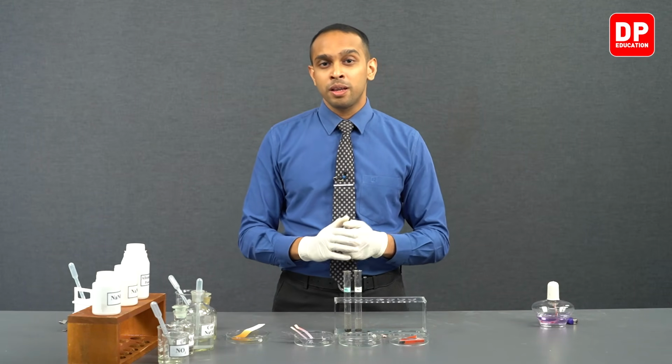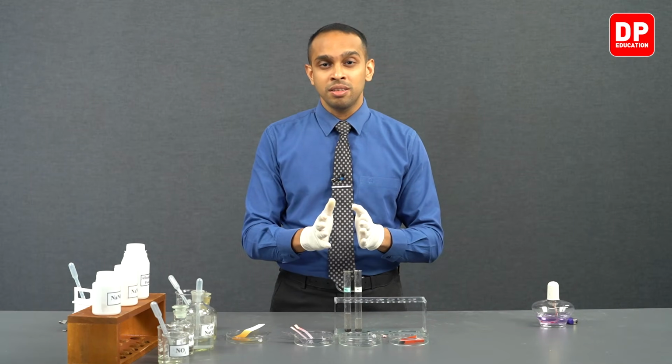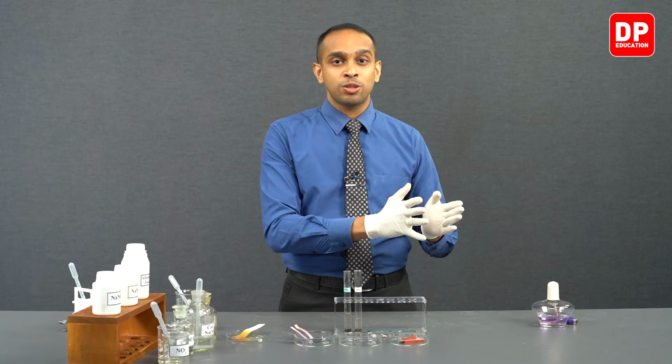So therefore, the color of potassium dichromate will change from orange to green, and the color of potassium permanganate solution will change from purple to colorless. However, nitrate ions cannot get further oxidized. So if you react nitrate ions with acidified potassium permanganate or acidified potassium dichromate, you do not observe a color change.